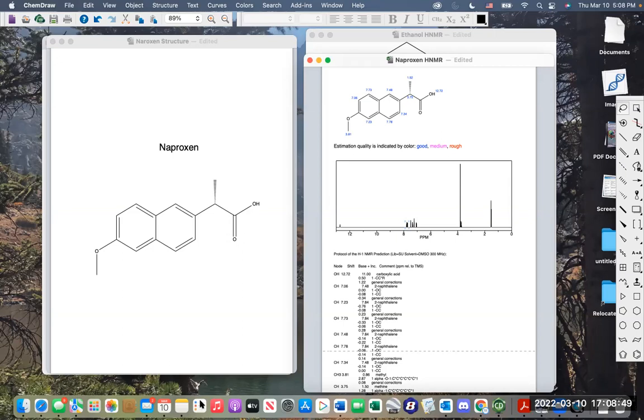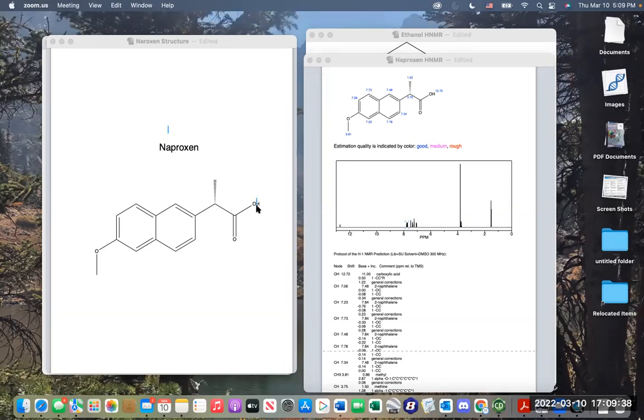And then let's go ahead and draw in the implicit hydrogens in this compound. To begin with the easy hydrogens, we have 1 here, and then we'll know that this is a methyl group, so we'll have 3 here. Nothing on this oxygen, just those 2 lone pairs.